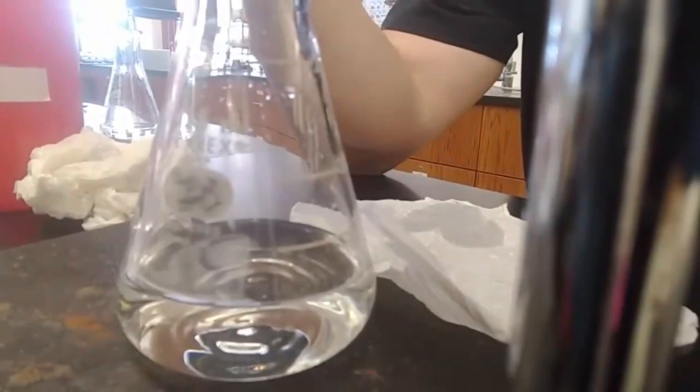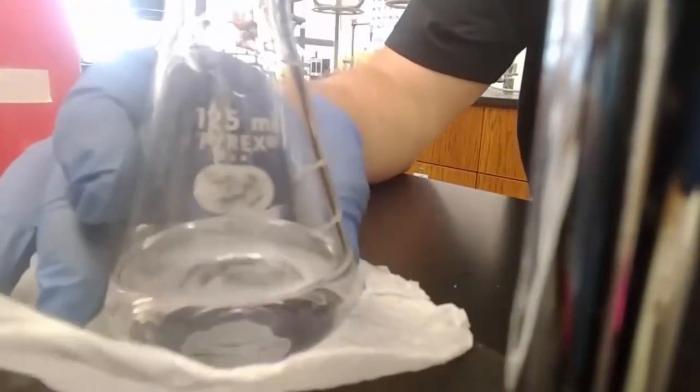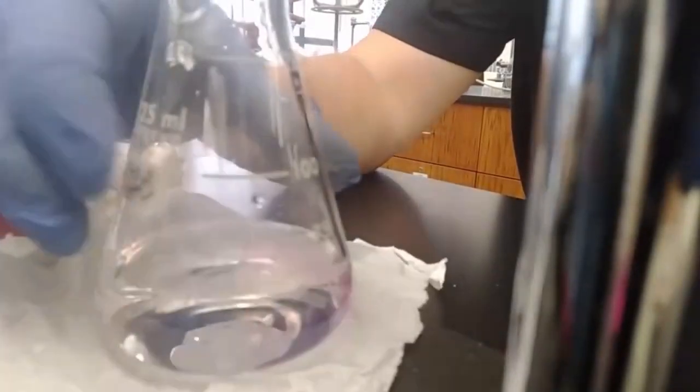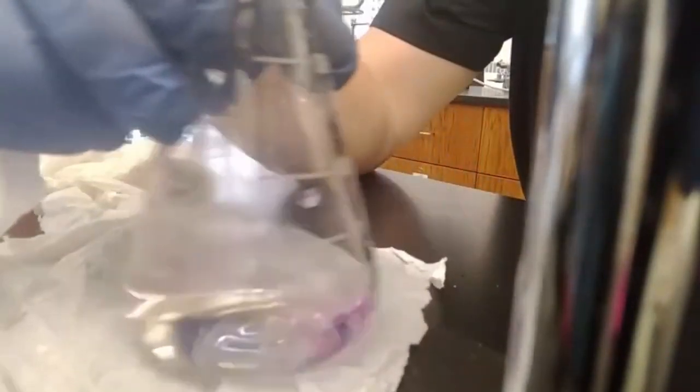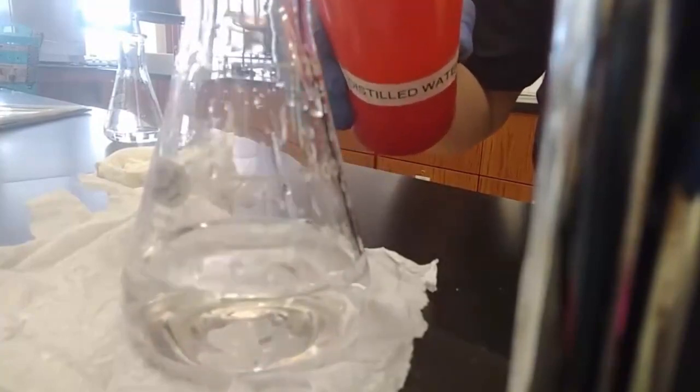Now let's see if I can really this time get it done with one drop to turn it from clear, colorless, to clear and pink. So we'll do one drop at a time, very slowly. Ooh, see that drop went on the edge there? We'll wash that down. In fact, let's wash that down now just to be safe. Okay, I washed it into the flask with my wash bottle. Rinse off the tip too. Here we go. Let's lower this in so that we're certain to not miss.